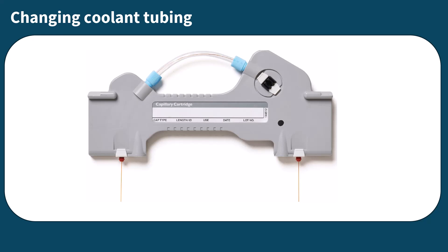In this video, we'll show you how to change your capillary cartridge coolant tubing. If you would like to change the length of the capillary, you must remove and change this tubing to correspond with the proper capillary length, as indicated in the required equipment and materials section of the relevant application guide.